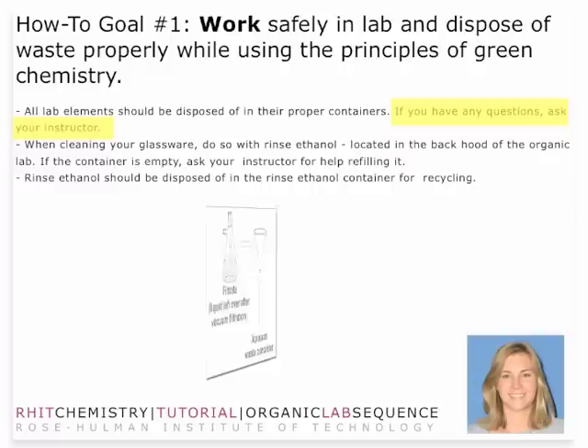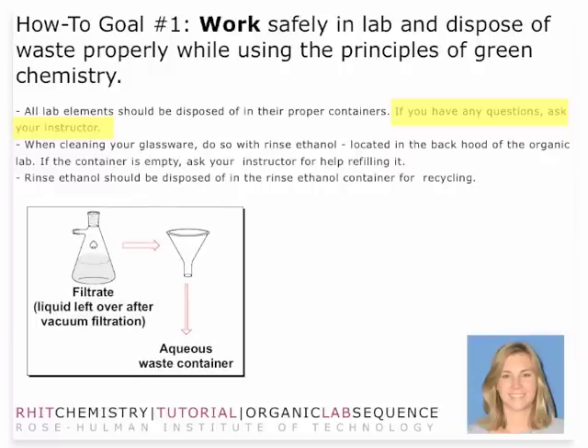You'll want to take your two major waste products. One is a filtrate, which is the liquid leftover after vacuum filtration, and dispose of that in the aqueous waste container. In that disposal, you want to make sure there are no solid particles and no organic matter in your filtrate. If you do have any solid that you are not able to separate from the solution mixture, then you want to make sure that you dispose of that in the flammable organic waste.